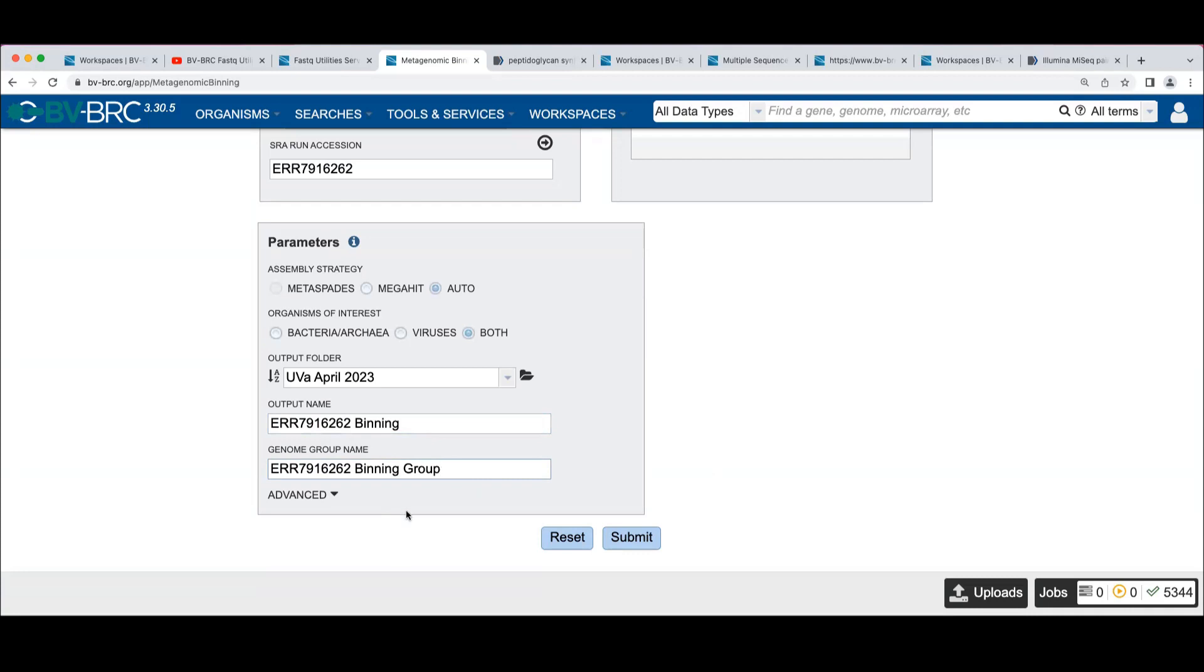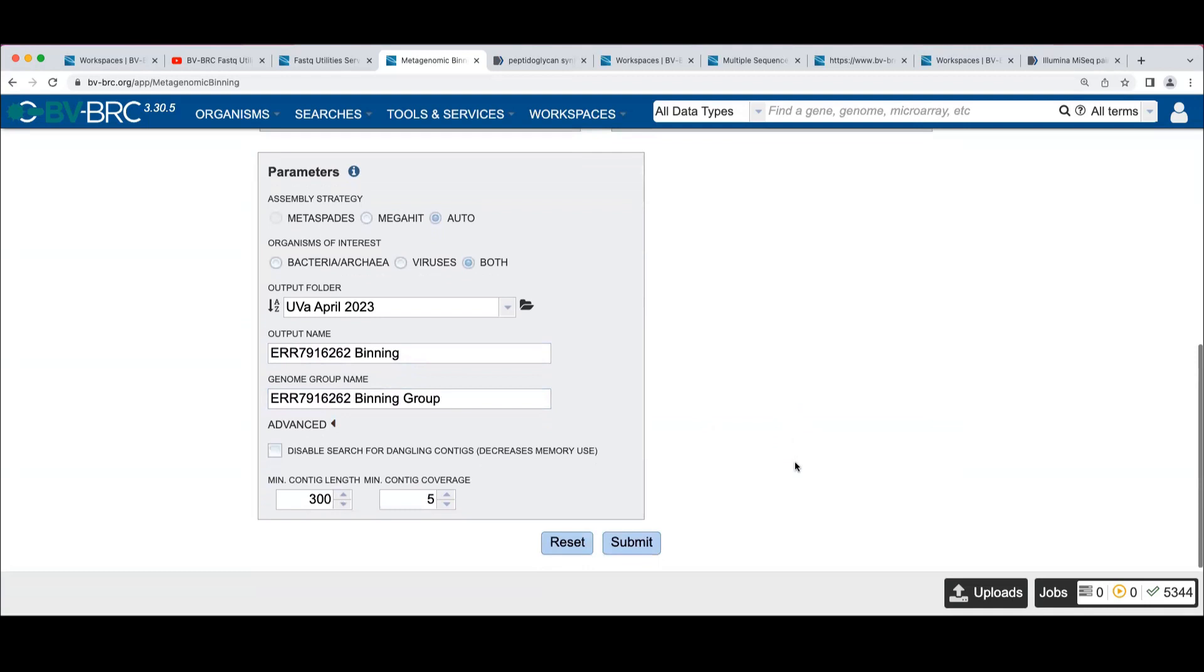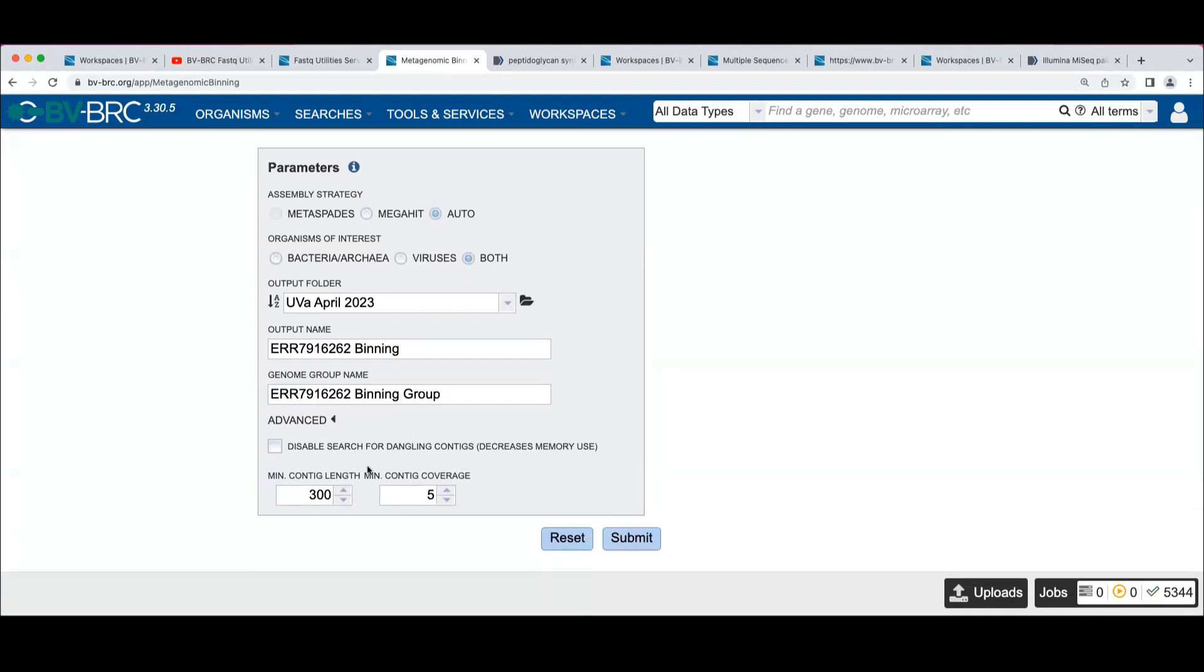The other thing to note here, I'm not sure if we talked about this, some of these interfaces have an advanced dropdown that typically are options that may or may not be interesting to change. So here we've got the thing that says to disable search for dangling contigs.